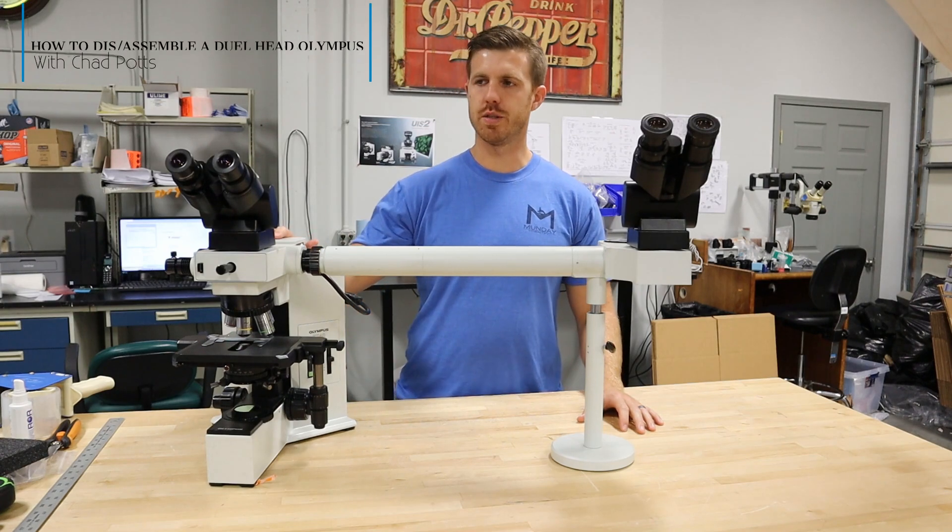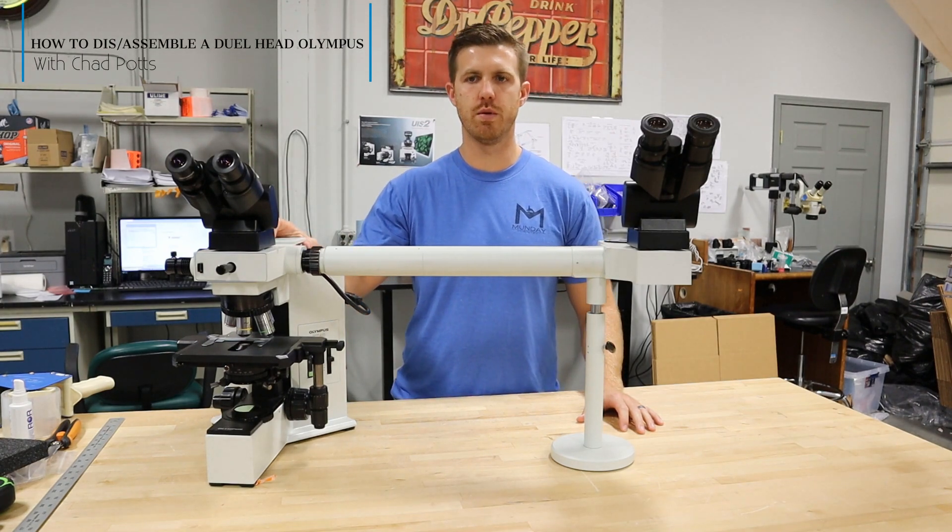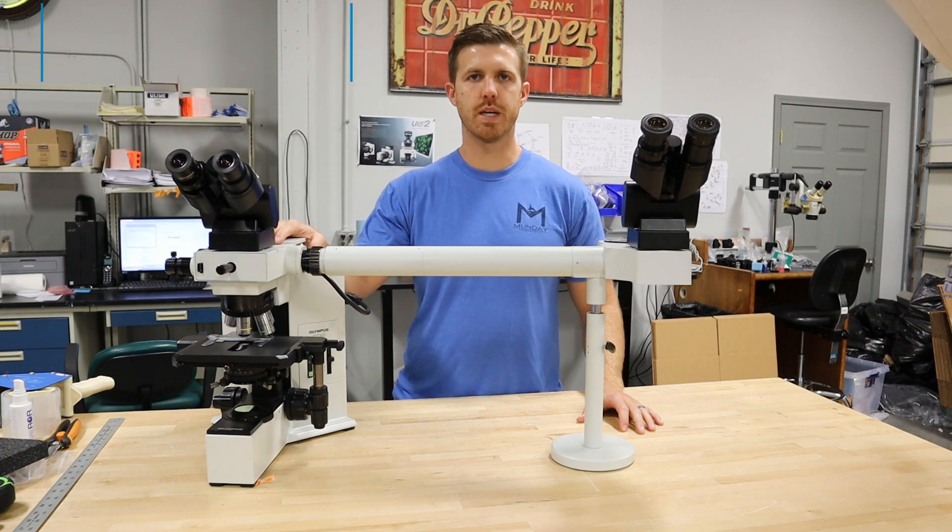Hey, this is Chad with Munday Scientific. Today I'm going to show you how to disassemble and reassemble a multi-headed Olympus BX microscope.